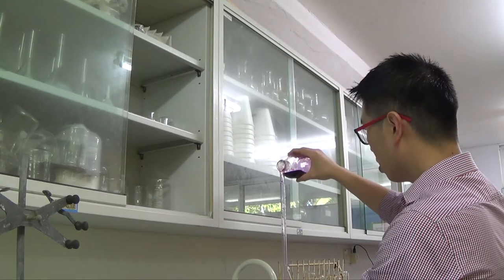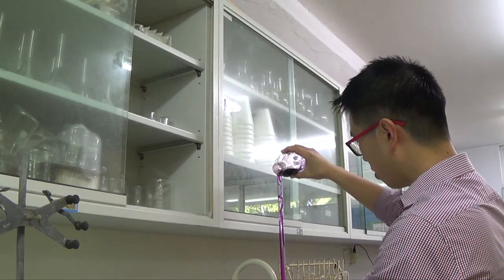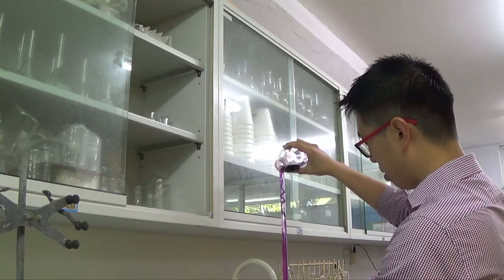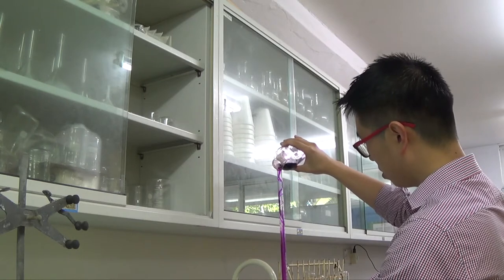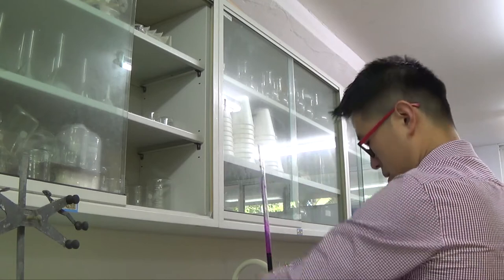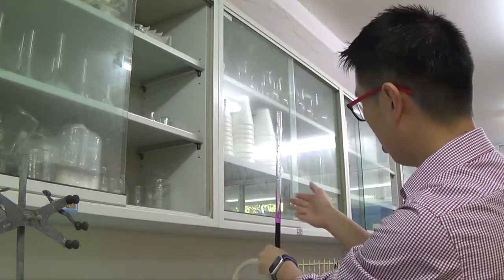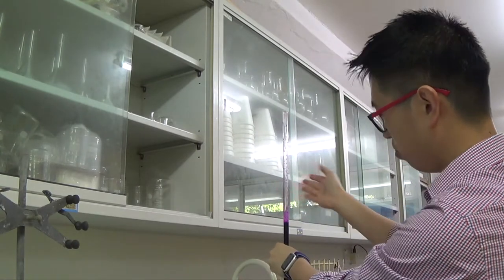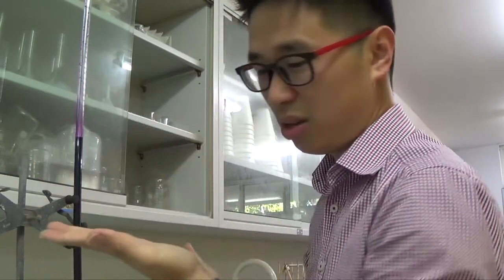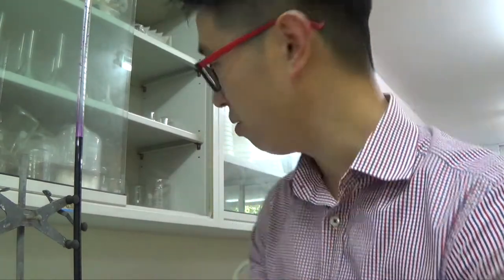So fill in the burette. So we roughly know the endpoint is around 23.4 roughly. So I don't need to fill out all the way to zero now, because I roughly know what my accurate endpoint is now. Again, you do not necessarily have to fill it in to the whole number, because you'll just be wasting your time if you fill it into the nearest whole number when you know that you could have like a random reading. I remember 11.50 or 11.55 or whatever.